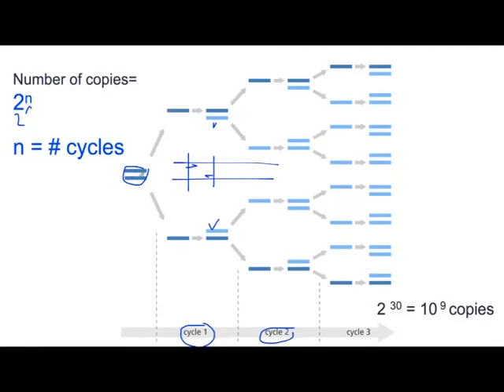And usually in PCR, you don't start with one molecule. You start with a bunch of molecules, a large amount of molecules. So the amount of products you're going to get is very high. And that's why PCR is considered a very sensitive method. In viral detection, like in coronavirus, usually they use PCR because you need only a very little amount of the sample for it to be detected. And this is all because amplification in PCR can make you thousands, even billions of copies, and you can detect them using different techniques at the end of the cycle.